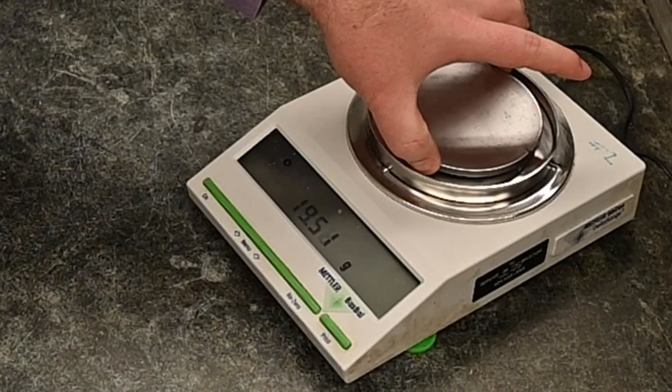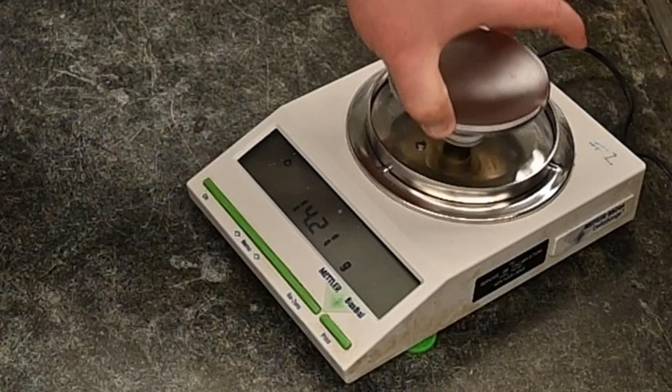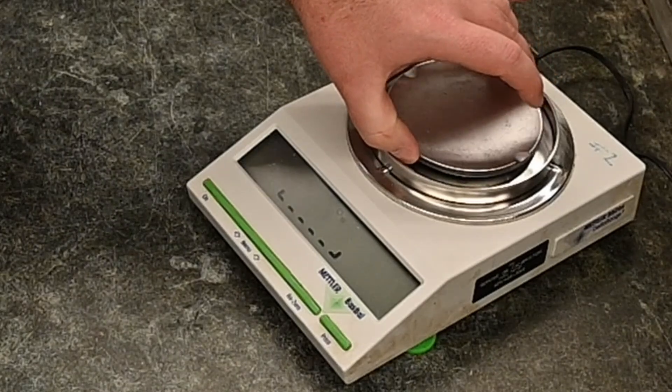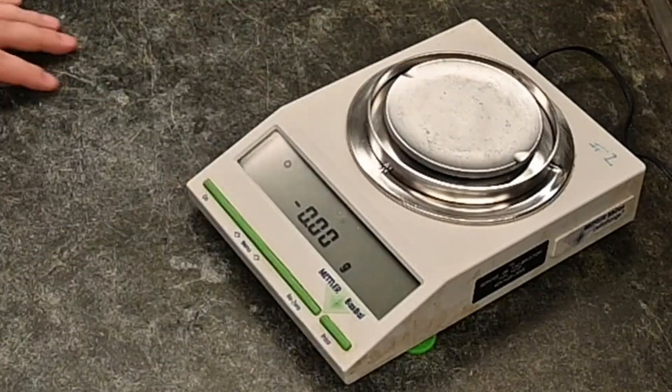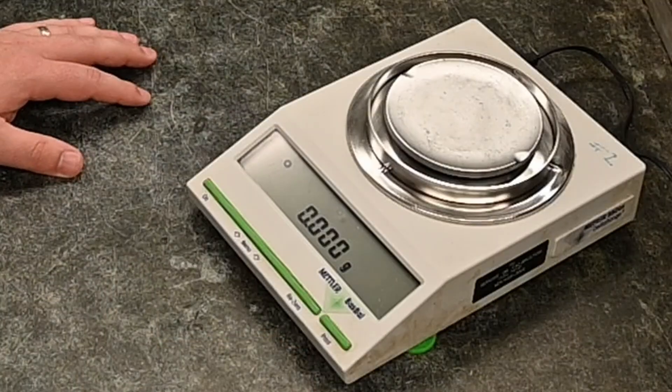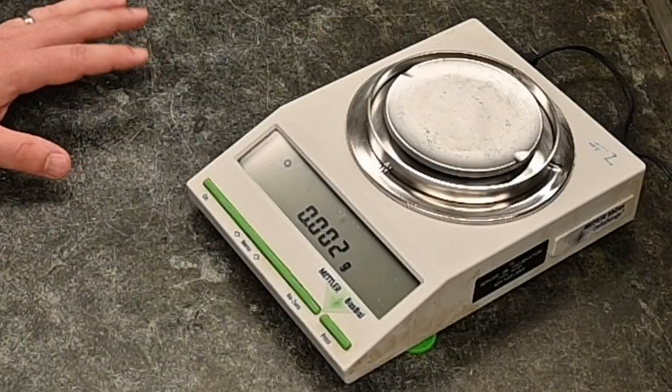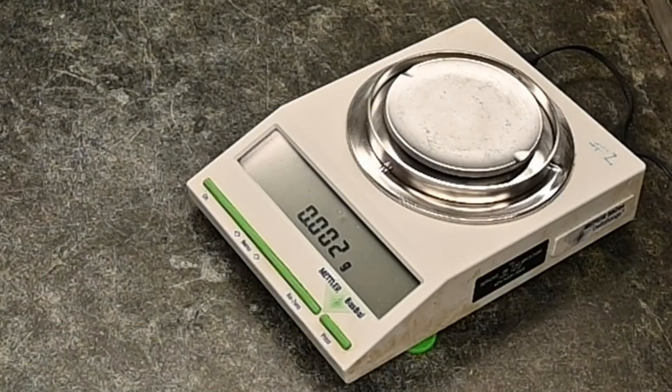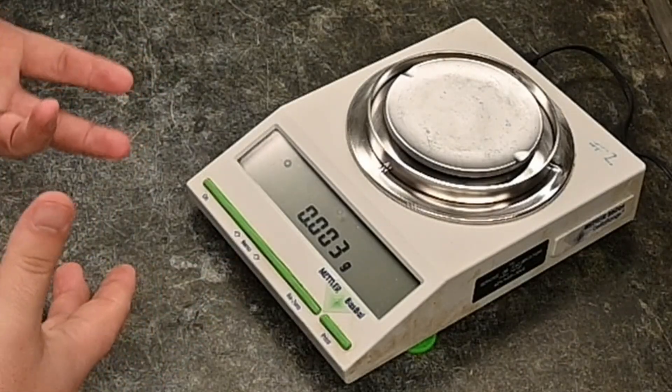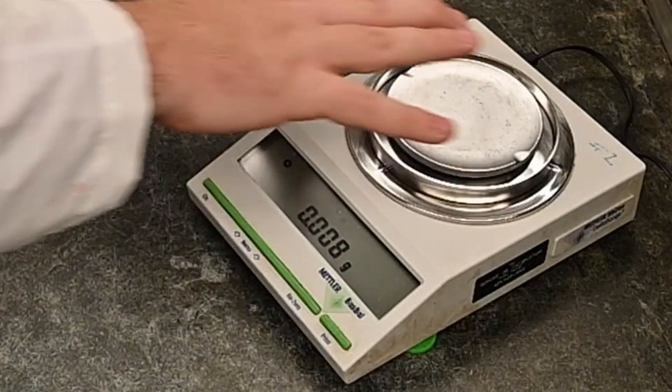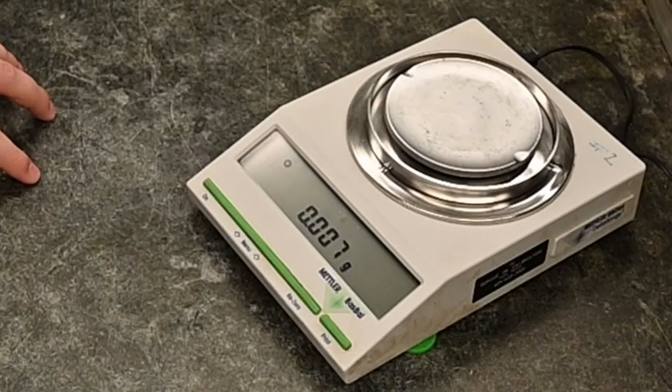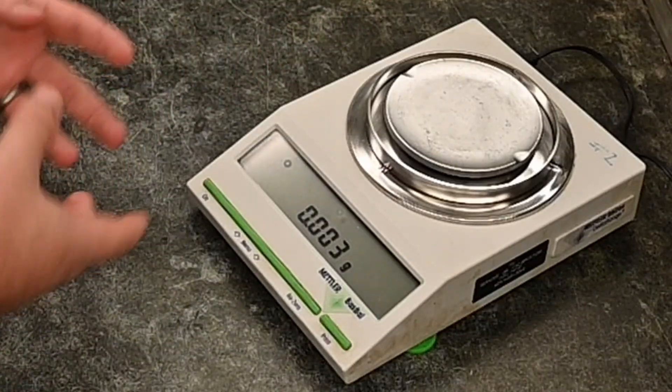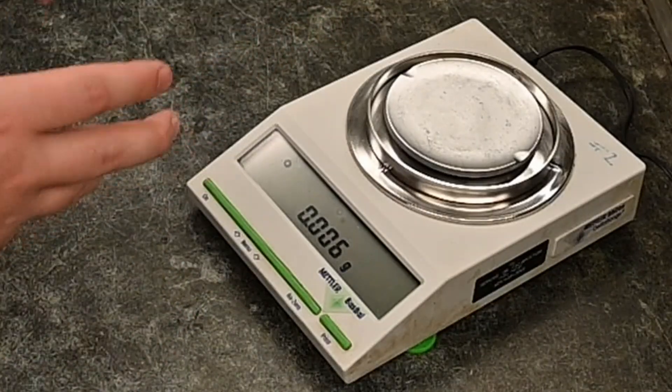You'll notice that they usually have these plates on the top. Just make sure that they are on securely and flush before you begin. One thing that I was taught, and it just depends on the type of balance, is that you don't want to put anything on there that's too hot. And I know for mine, there's actually a few more plastic pieces. So the idea is if you place something really hot on there, the heat can transfer through the metal into the plastic and can kind of warp things.